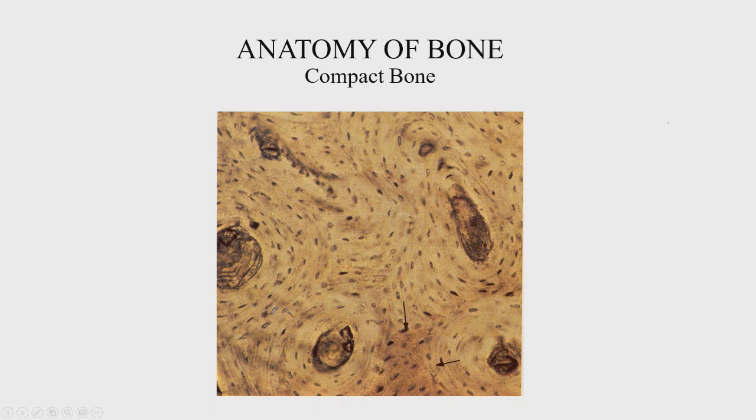It shows you the concentric lamellae. It shows you the ring pattern. It shows you the canaliculi. It shows you the haversian canal where my pointer is pointing right now. This would be where the osteocytes are. They would be within these lacunae, these dark spots, but you'd be able to visualize them, as I said before, through the nuclear staining. And here you see this is where the vascular system is, the vessels. And this is basically compact bone tissue.